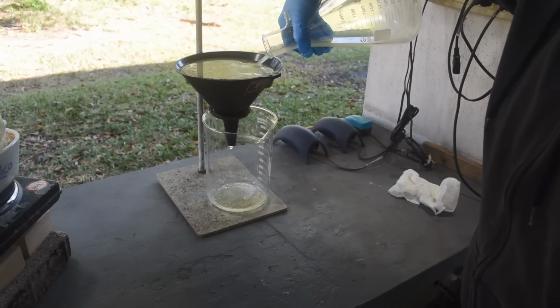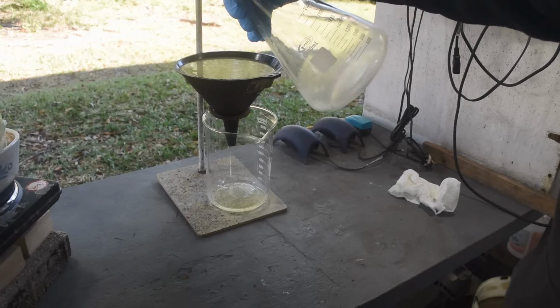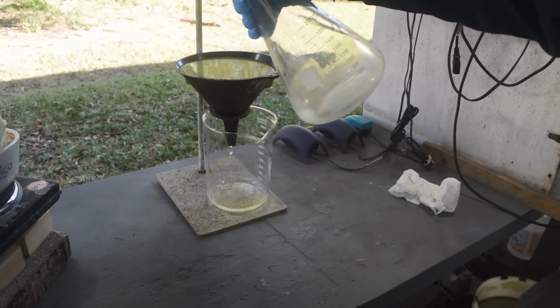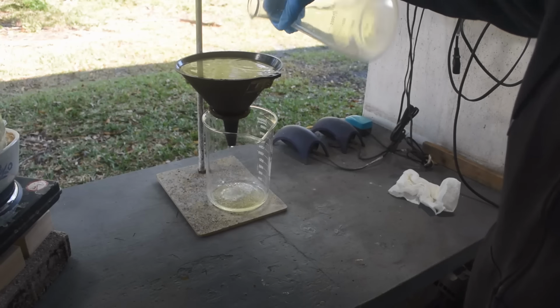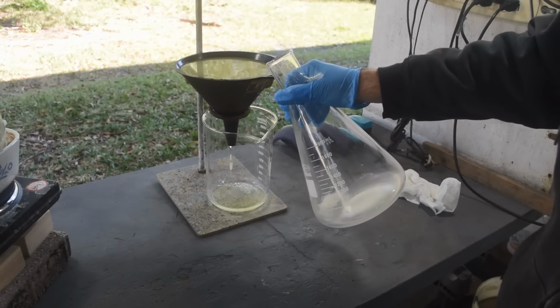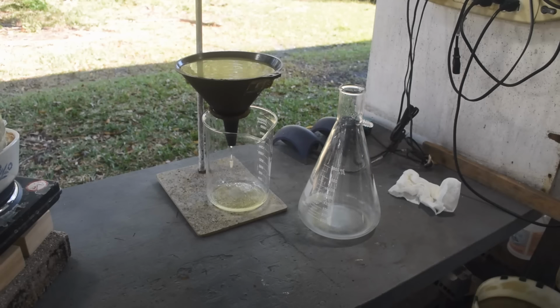Oh, wow. Look at all the solids in the base of that flask. Holy cow. Yeah, that definitely looks like lead chloride, and then that cloudy stuff looks like lead sulfate. But we're getting the lead out. All right, so we're just going to let that go, and we'll be back when we're finally ready to drop the gold out of this stuff and see how much gold we're getting.